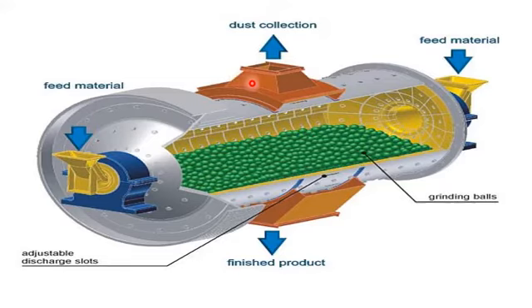The powder material is taken inside the milling chamber. Usually, the bulk material in ball milling is in the form of powder, and the ball mill crushes that powder into nanoparticles or very small particulates.